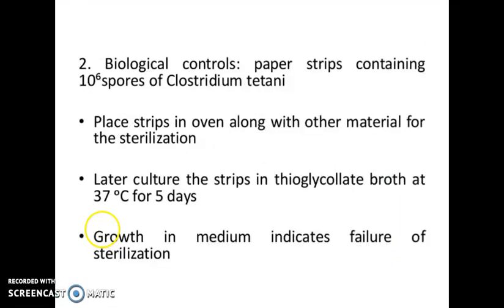Then another method is biological control, that is while placing the articles or materials for sterilization in the oven.